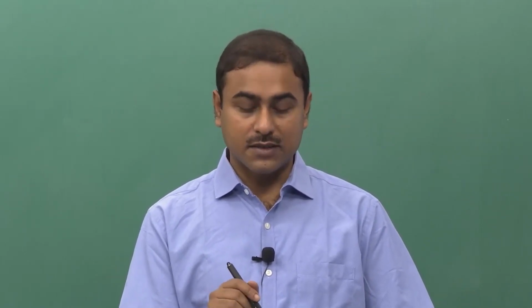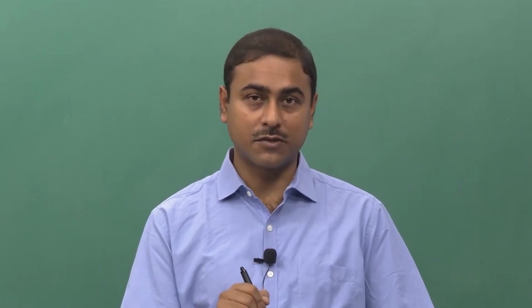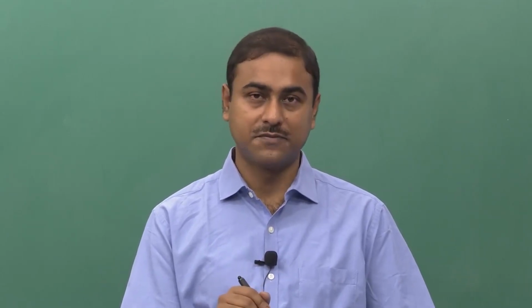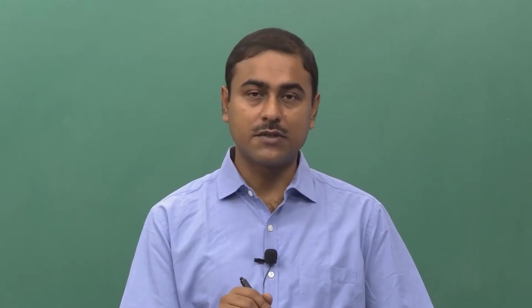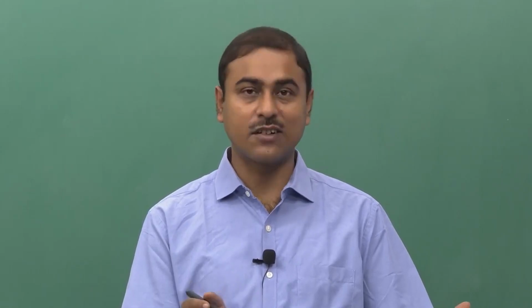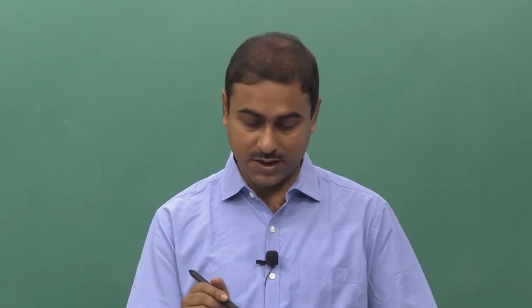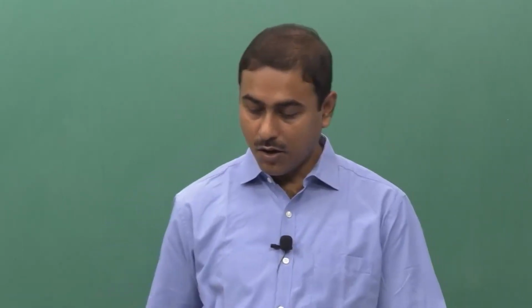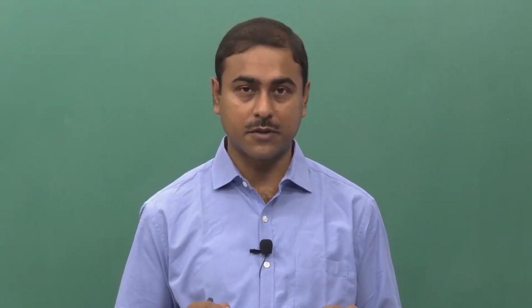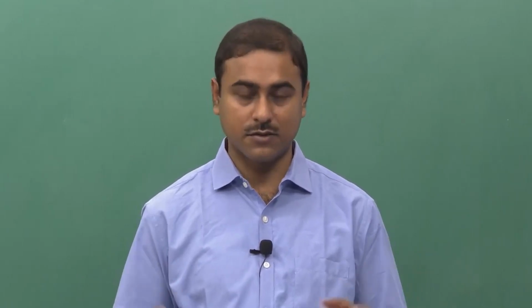Another thing is that you may ask, what if I am the first person to measure the fluorescence quantum yield, that means no reference is known. That is also possible, and we usually use the integrating sphere for this measurement, which I decided not to discuss in this case because of the time constraint, but it is possible. You can check in the literature later on. But this comparative method of the measurement of fluorescence quantum yield is well accepted all over the world, and people are every day using this method. So, this is good enough for this basic course.